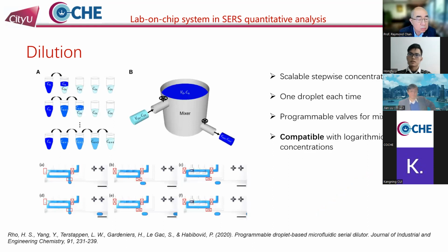Here are some existing applications. The first method demonstrates an idea of the programmable microfluidic chip. The principle is to inject the diluent while draining the mixed samples of the same volume. The scale of the droplet can be easily adjusted by changing the pressure of the fluid or the expanding time of the valve. And the mixing of the sample depends on three programmable valves.